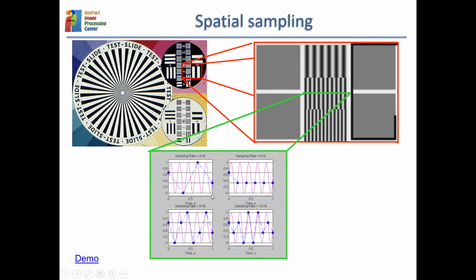And as we said before, we cannot record absolutely every possible value in the space in the computer. So we need to sample our input structure, and we will do so by placing a sample on the up and down signal every fixed amount of space, every fixed length.